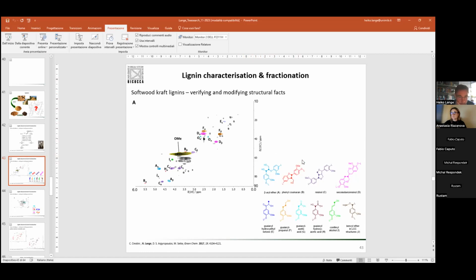That's a very good question. So what we actually see, if you see the slide now that I have here, what you really say on the basis of the HSQC is that you have this structural motif, for example. Because the dotted carbons in the chain here are the signals that are most relevant, and also used for quantification. I also see the third one, this gamma position here. Right. I see that, but I normally tend not to use it for quantification, because the gammas are extremely difficult in the HSQC. Even if you run it quantitatively, they tend to make trouble.